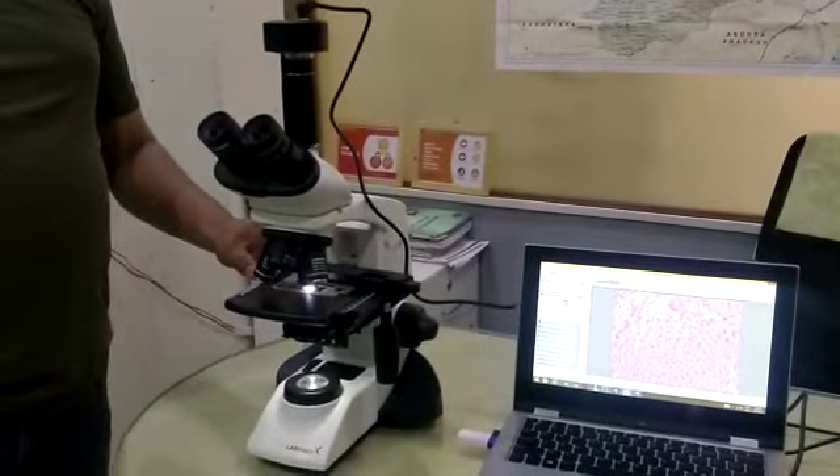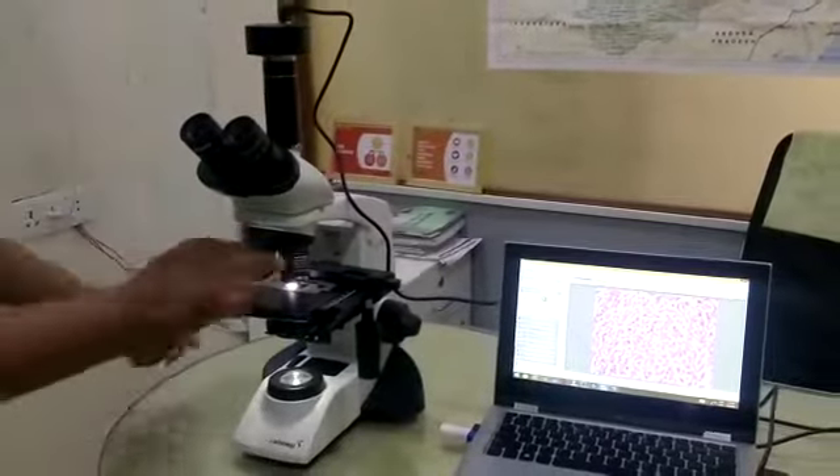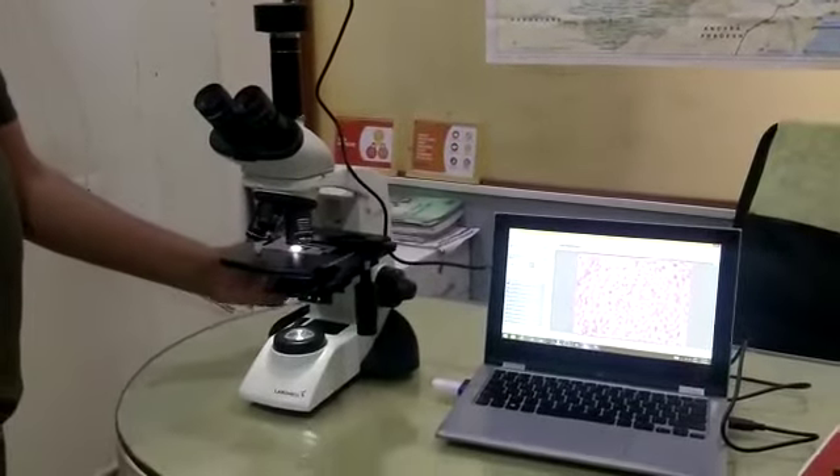This has got a single slide holder, so one slide can be kept at one time. The coarse and fine movement is very soft as compared to the older model.